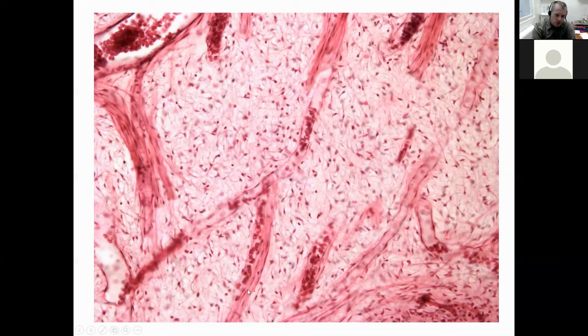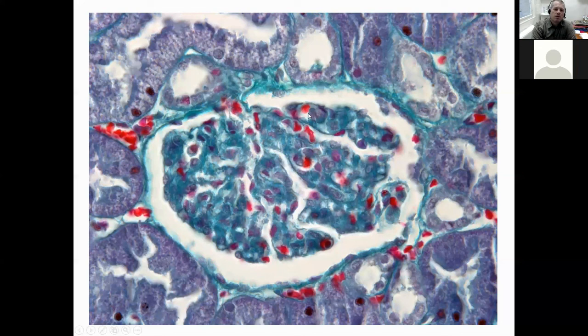And this would be an example of capillaries from the renal corpuscle, from the cortex of kidney. You can see the red blood cells inside. And in this case, the capillaries are forming a tuft, a glomerulus, many loops of capillaries together, being surrounded by the internal layer of the Bowman's capsule, that are cells called podocytes, epithelial cells that are embracing the capillaries with their processes. And among the branches of these finger-like processes, they have the filtration slits through which the blood plasma is filtered into this urinary space that takes it to primary kidney tubules.